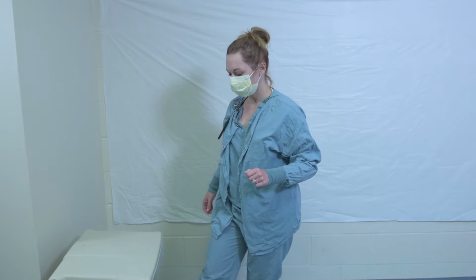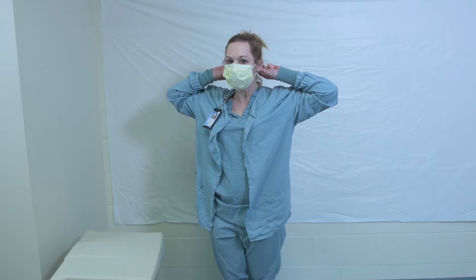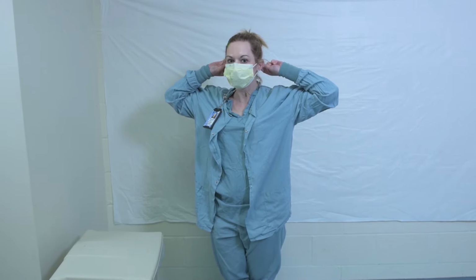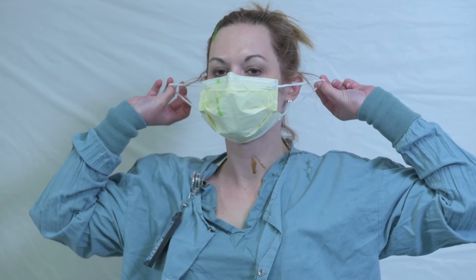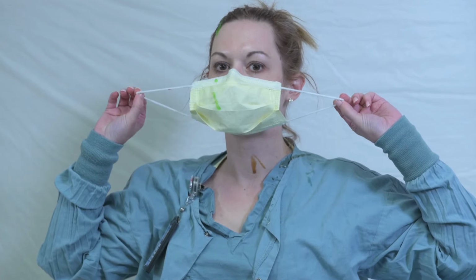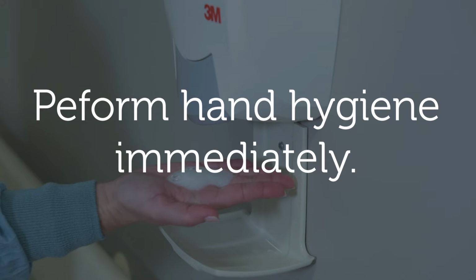The mask is removed last to prevent transmission of contaminants to your respiratory tract while removing the other equipment. Remove mask or respirator using ties or elastic to prevent hand contamination and discard. Masks are to be used one time only and then thrown away. They should never be worn around the neck or carried in your pocket.